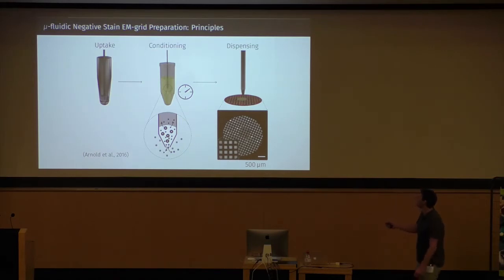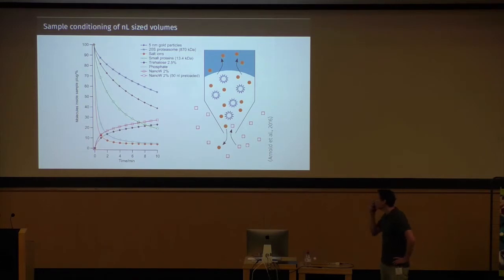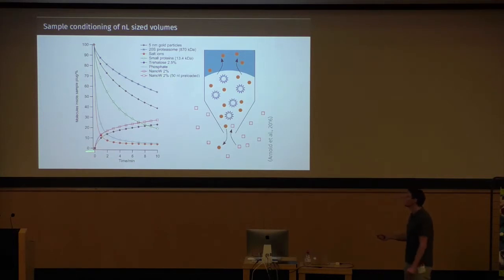And here in the corner you can see an overview picture of a grid, and if you look closely, you see the area where the sample was written onto the grid. The conditioning for the staining I just mentioned relies on the fact that salt ions and stain, here a tungsten-based stain, diffuse much faster than proteins. So if you just condition for a few minutes, most of the salt goes out of the sample plug, the stain goes into the sample plug, but most protein still remains within this sample plug.